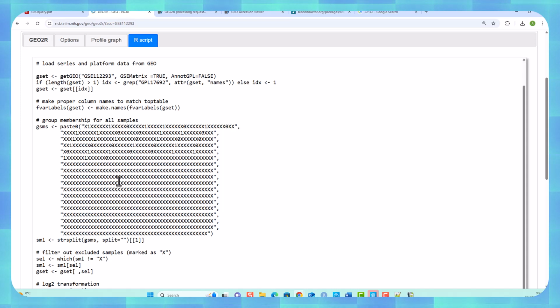matrix of X's. So this is saying skip the first one, which we know is the patient before they've actually been vaccinated. Collect the one after 12 hours, and that one is in group 1, that one's in group 1, this one's in the untreated group, which is 0. This is in group 1, this is in group 1, this is in group 0, this is in group 1, this is in group 0, and so it goes on and on to do all that. Okay?